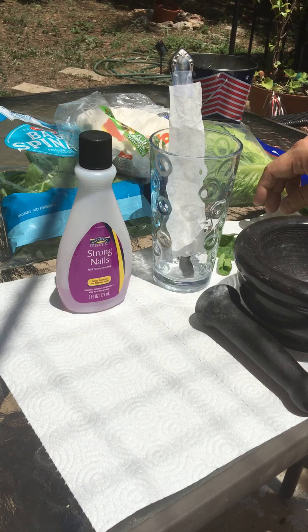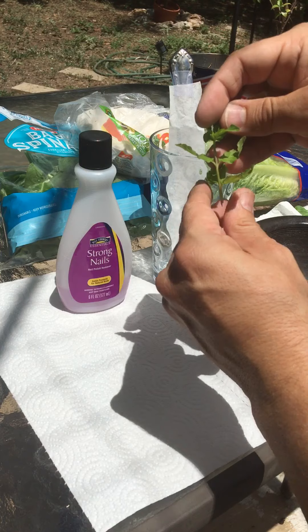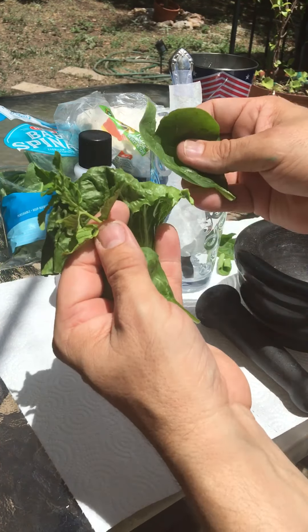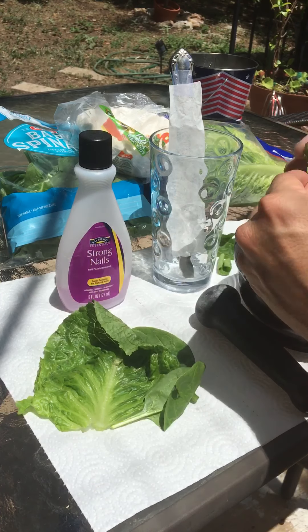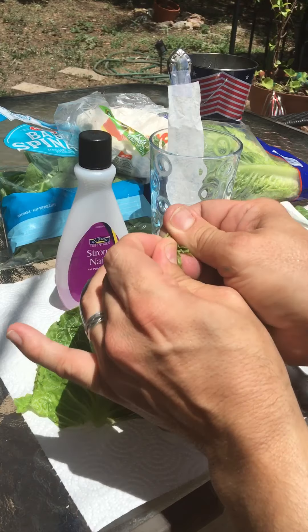There you have it — spearmint, lettuce, and spinach. Let's go ahead and start grinding these up. I'm going to tear them up into little pieces, hopefully you can all see that.